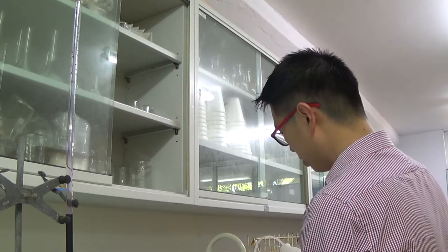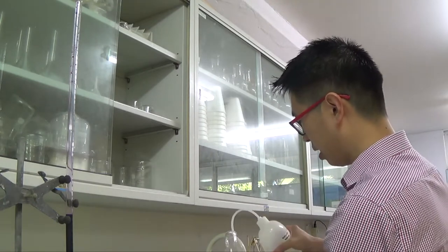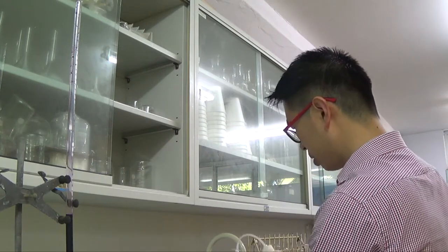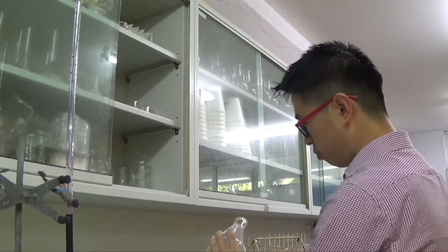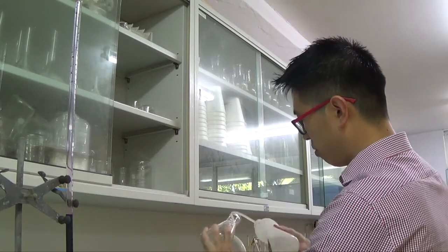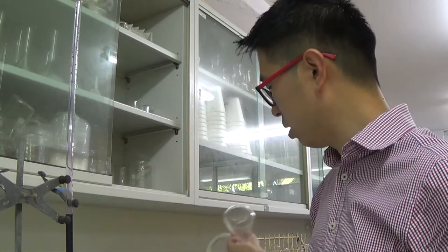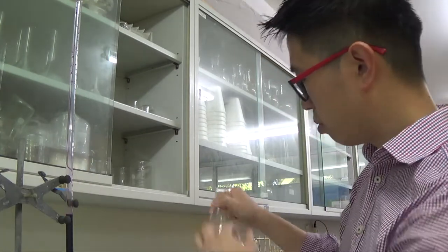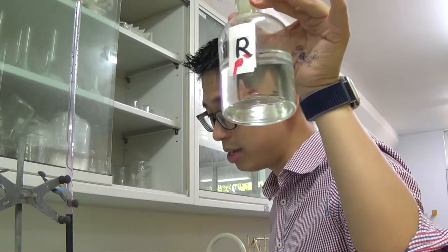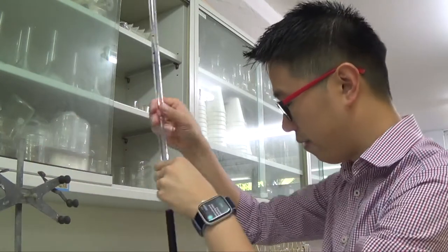So I'm gonna chuck this away. I might or might not need this later on, but I'll just wash it with distilled water, because depending on how our second accurate titration goes, we might need to do a third one, just in case. So when you wash conical flasks, make sure you swirl on the side, because you never know what is left on the side. I said earlier, if you're left with a little bit of distilled water inside, it will not affect your endpoint, because whatever you prepared into here is a fixed volume of known concentration from the iron 2 plus, and therefore your mole is the same, and if your mole Fe2 plus is the same, it will not affect your endpoint at all.